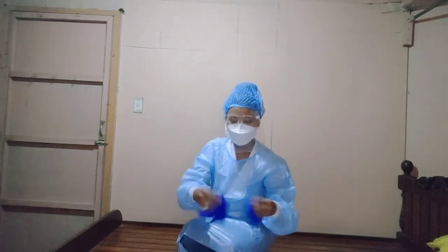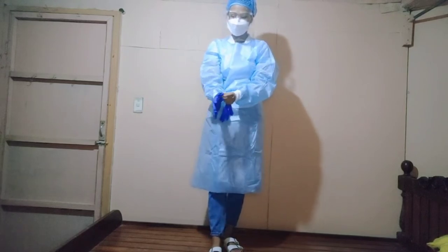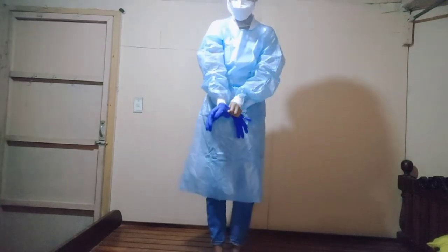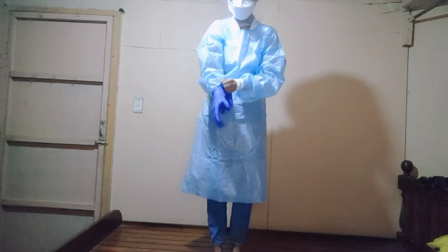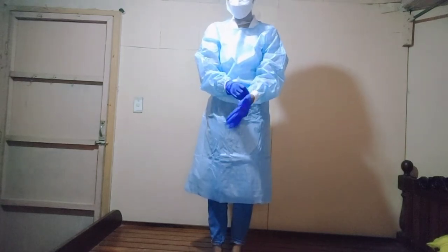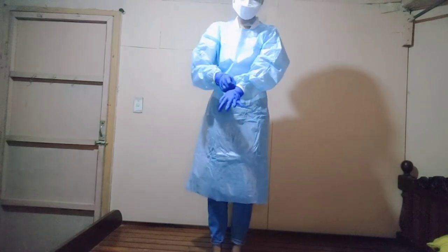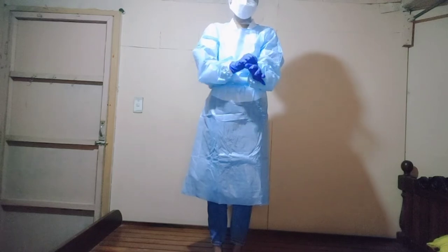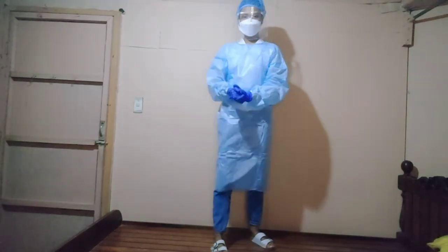Next, we have to put on our clean gloves. We were already taught how to wear a glove. What we need to do is pull the glove to cover the cuffs of our gown. There's no single specific technique for wearing a glove — just practice. If you're not wearing a gown, make sure your wrists are covered. But since we are wearing a gown with elastic cuffs, we're good. That's it for our PPE donning — we are ready for duty.